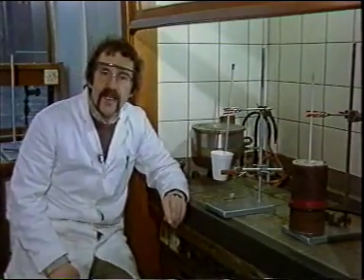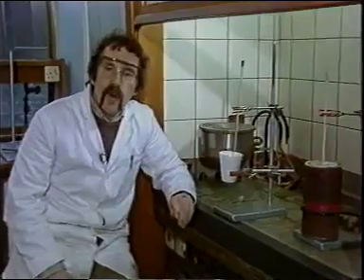For the last sequence, I'm going to show you one of these reactions using sensitive reagents carried out at a low temperature, and we'll need to set this up in the fume cupboard. In this reaction, I shall be adding butyl lithium to a solution of diphenyl acetic acid to generate the dianion.